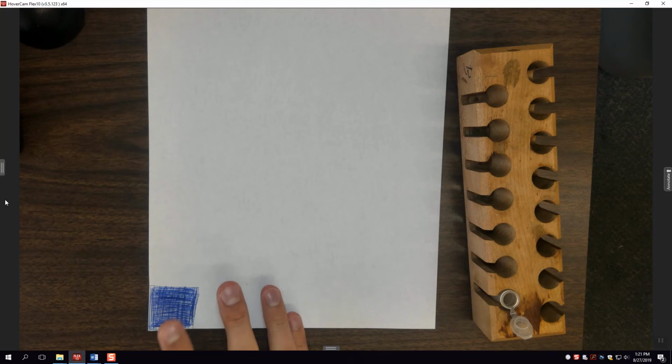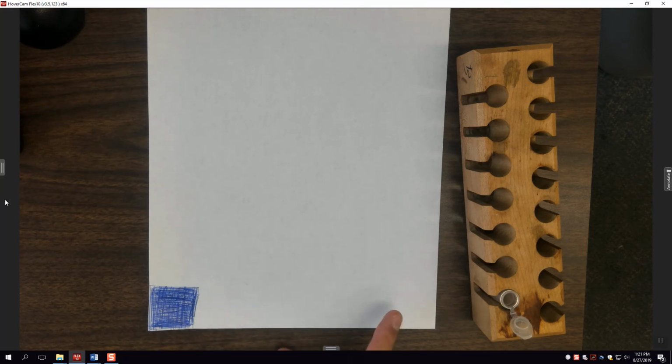So instead of that, what we suggest you do is, for each of your standards, whether this is the suspect's pen found at their location or one of the pens that you suspect may have been used, make a box like this. Now, does it need to be this exact size? No, but make some kind of scribble. It could be a circle, or it could be a box, it could be whatever you want, but make some kind of scribble like this.